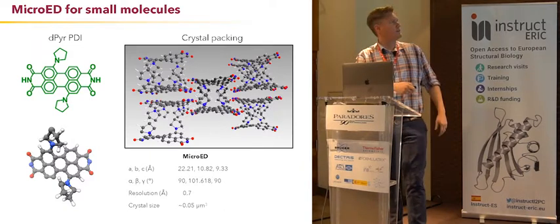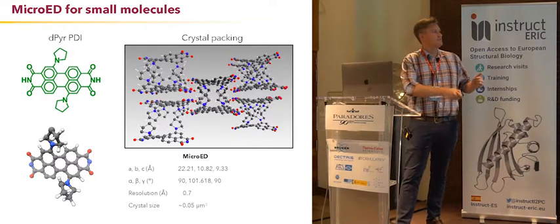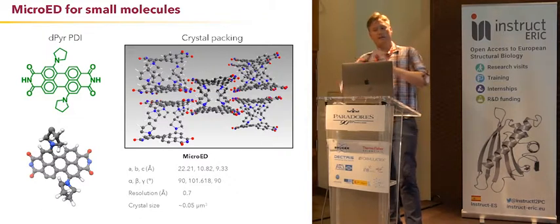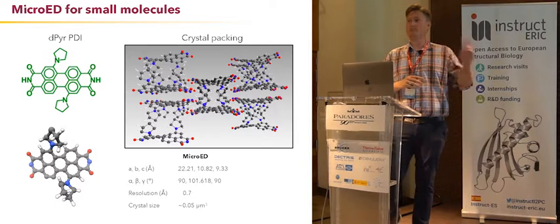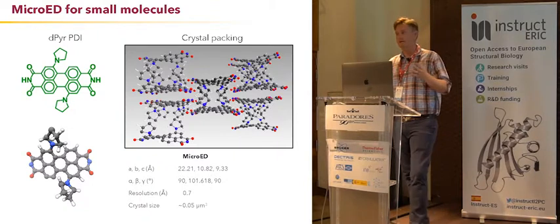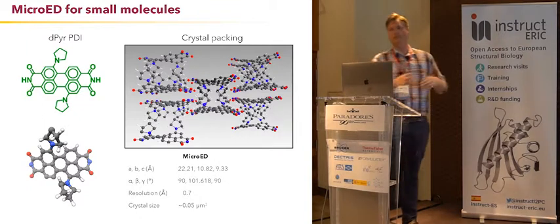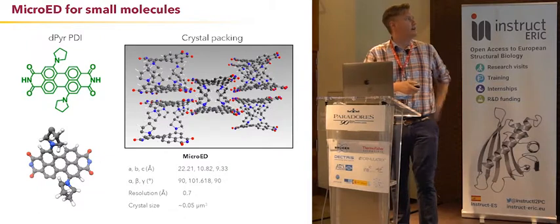So they were really excited about this. This wasn't the compound they were really searching for, but as they dug through their files, they said, okay, well this is compound A. I looked back at some other data, and we actually saw there's at least one other unit cell and maybe a third unit cell on the same grid that we have data for. So we think we might actually have from one grid compound A, compound B, and then the complex together. Just from one grid, we're getting all of the data. We only spent about an hour and a half collecting this data, so I'm sure if we'd gone back and collected more data, we could probably have solved all three of them, and we're going to return to this later.